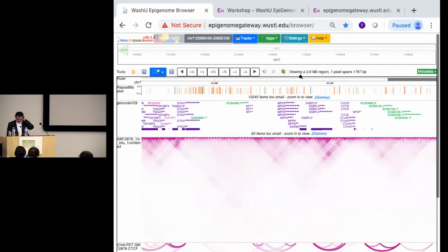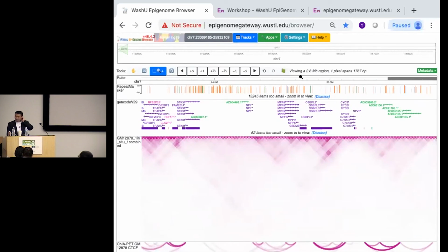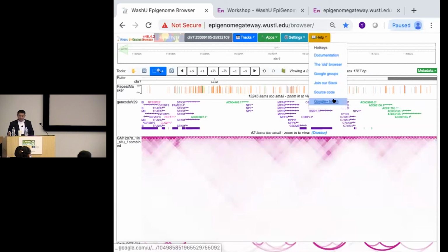That reminds me of one of the questions: do you have an FAQ or archive, so that whatever question I have, you have an answer? Do you have an archiving system for people to search? Can you show that? That's right. In previous years, we've mainly been using this Google Plus forum. People ask questions there and everything's archived.